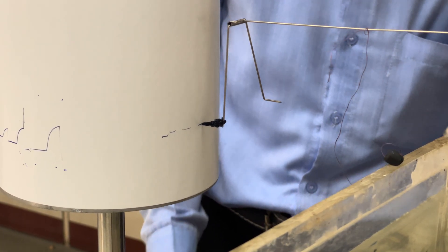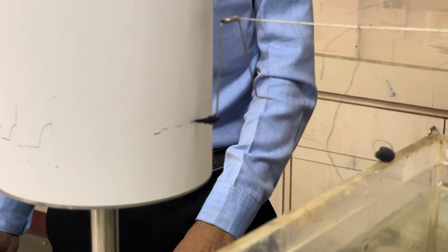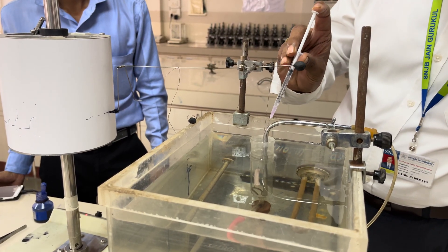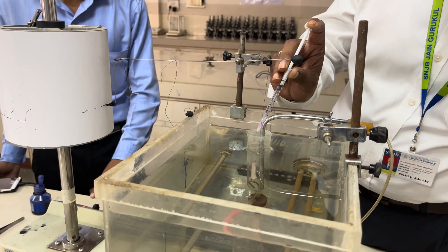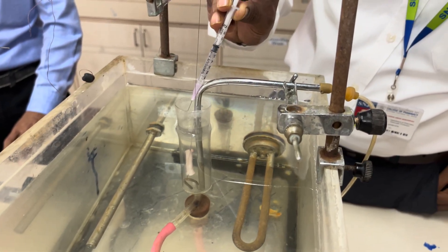After 30 seconds of baseline recording, without interfering with the kymograph recording drum, add the drug. Care should be taken that the needle is inserted into the PSS and the drug is slowly released.